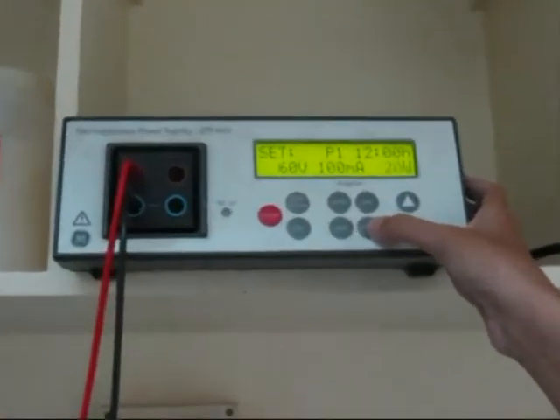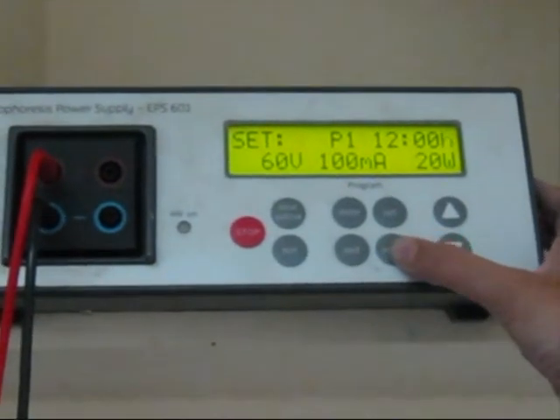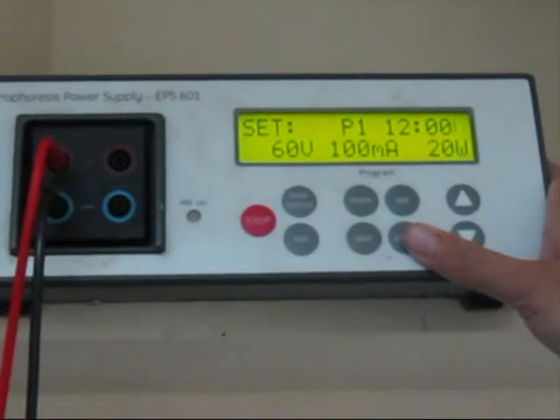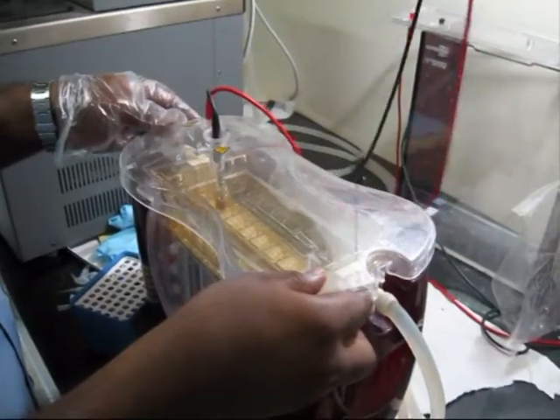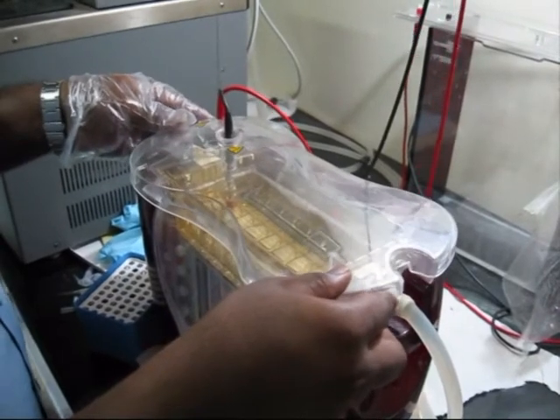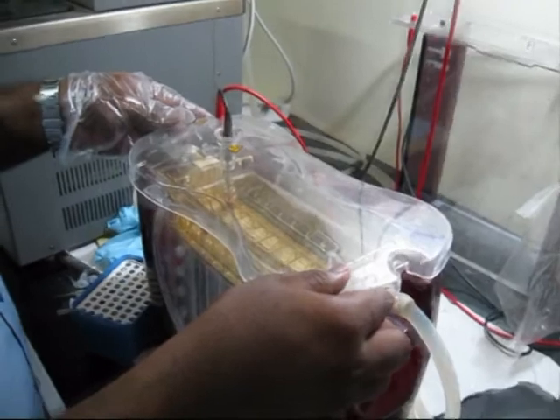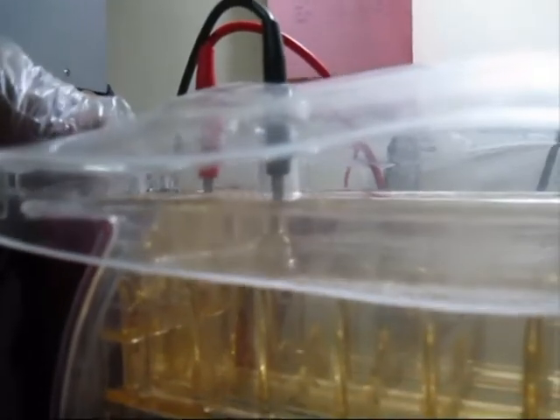The voltage for running the gel is set at 60V and 100mA. Gels are usually run at a voltage that will run the tracking dye to the bottom as quickly as possible without overheating the gels. The gels are usually allowed to run for 12 hours.